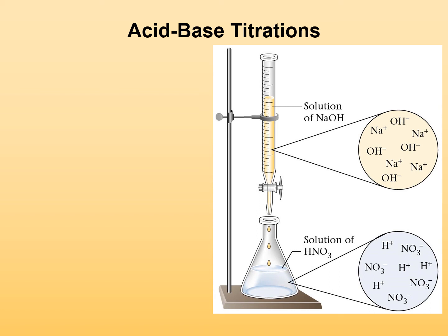Hey guys, in this video we're going to address the lab process for titrations. We have done these earlier in the year, so this should be mostly review. We're going to be covering a little bit more about the different types of titrations, whether you have strong acids and bases, weak acids and bases, things like that.